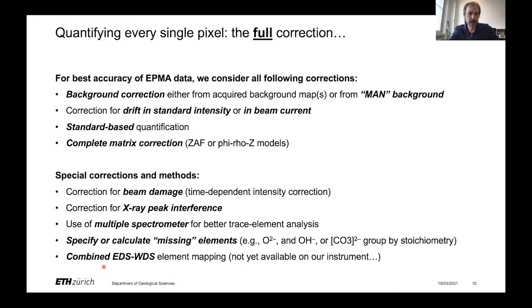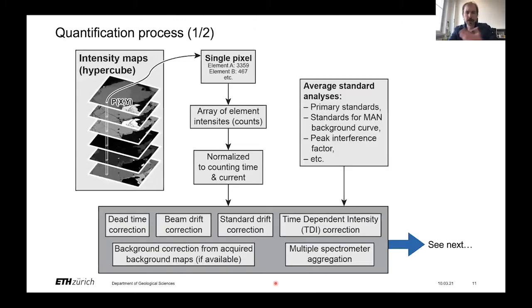And finally, I hope that in the near future, we will be able to do combined EDS and WDS element mapping. This is unfortunately not yet available due to some software incompatibility, but hopefully an update will come soon. So in the interest of time, I'll maybe skip these 2 slides, but it basically describes how we proceed to quantify these maps.